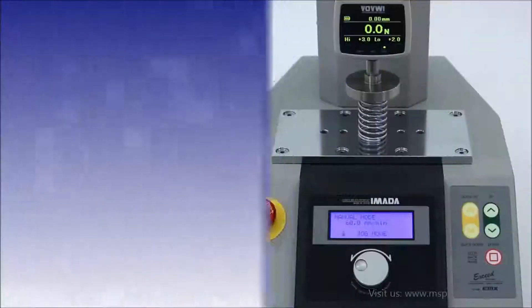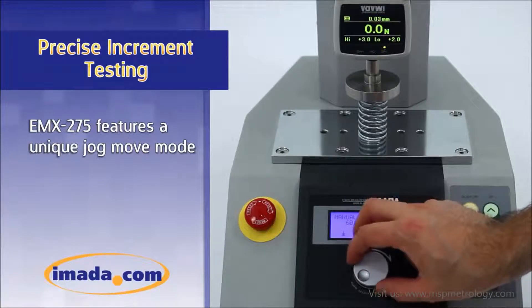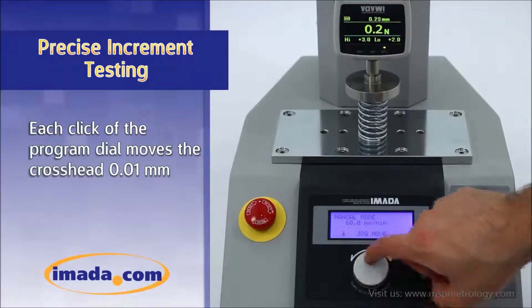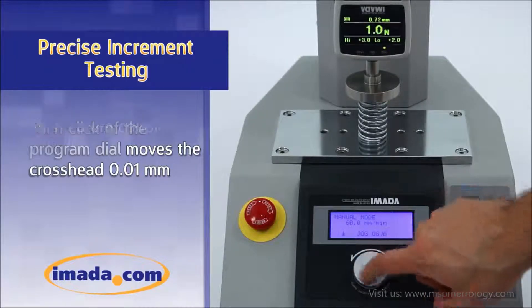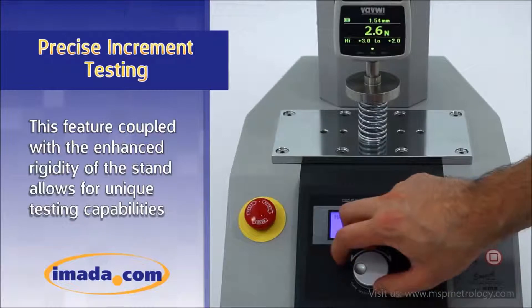The EMX275 also features a unique jog move mode. Each click of the program dial moves the crosshead approximately 0.01 millimeters. This feature, coupled with the enhanced rigidity of the stand, allows for a unique set of testing capabilities.